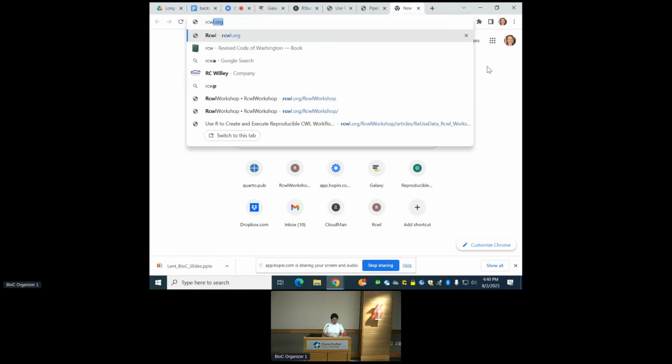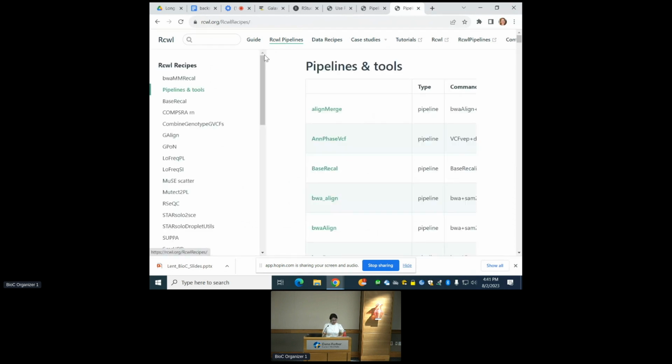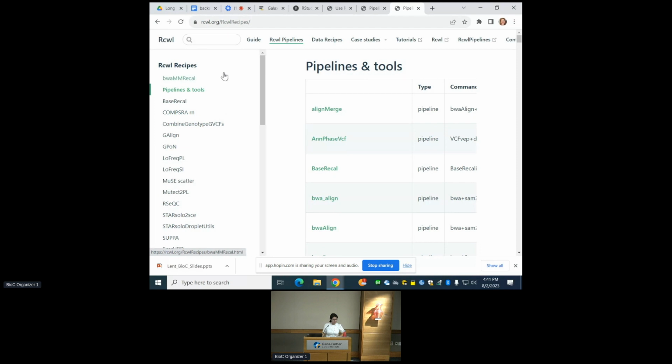If you go to this website and go to the RCWL pipelines, you can get a list of all the existing pipelines. Actually, we are not there yet, so next we will make all the tool recipes available here, but currently we only have the pipeline recipes. Just click on one of them.